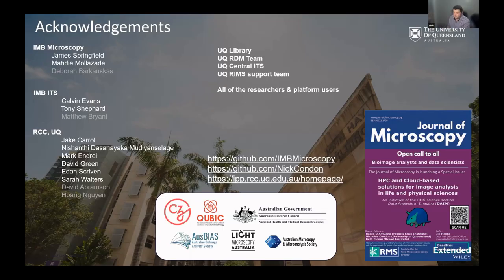So the virtual machines are, as I said, static, so we just build them and then leave them. We run Stratacore PPMS and we name the VMs by planets and Greek gods. You book out that instrument, you get that instrument for the time that you have, and the licensed software that lives on it stays licensed there. So they are IP locked to the machines. So yes, you book the instrument, you get it for that time.